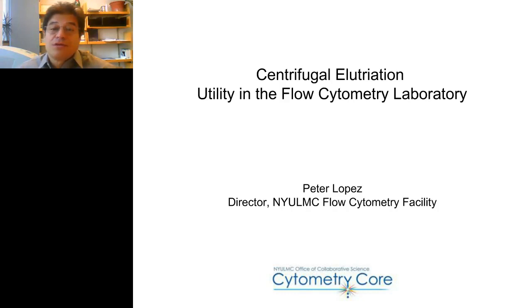The goal of this presentation, in a way, is to potentially draw all three of these groups together around the utility of elutriation in a flow cytometry core specifically. So let me start with my first slide. And I'm just having a little trouble bringing that up.